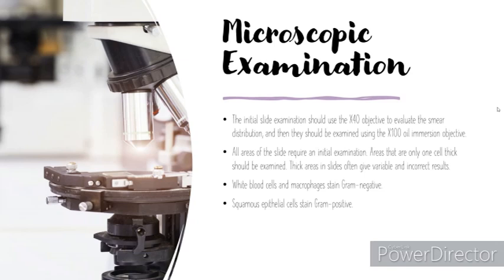So I did use 50x, but 40x and 50x are usually interchangeable. So 50 and 100 is what I use in the video.